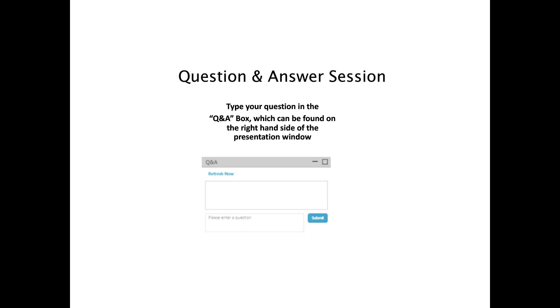Here's another question that just came in. Have you sped up the runtime for the IV with better quality of results? Yeah, I think I'll also take that one. As I mentioned earlier, the benefit and the disadvantage of the delay volume is that it allows you to get this beautiful operation and beautiful sensitivity, but you do have to wait for it to empty out before you make another injection. With this instrument, the runs that I was showing at the very beginning, the elutions were coming out in about 6 minutes or so, and then we had to wait another 6 or 7 minutes for the delay volume to empty.